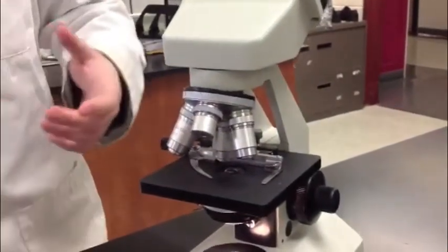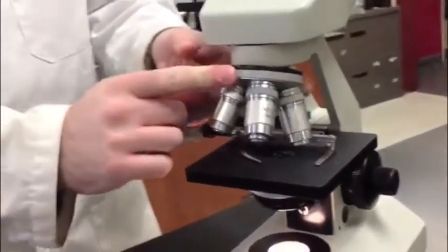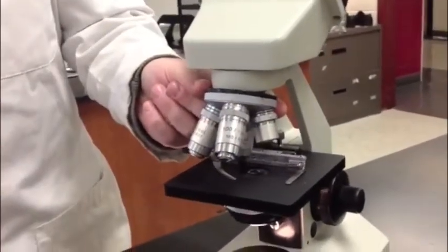It helps you generally focus on your object. Next, we have the low power lens, which is the 10x lens, the high power, which is the 40x, and the oil immersion lens, which is 100x, and should only be used when your specimens are covered in oil.